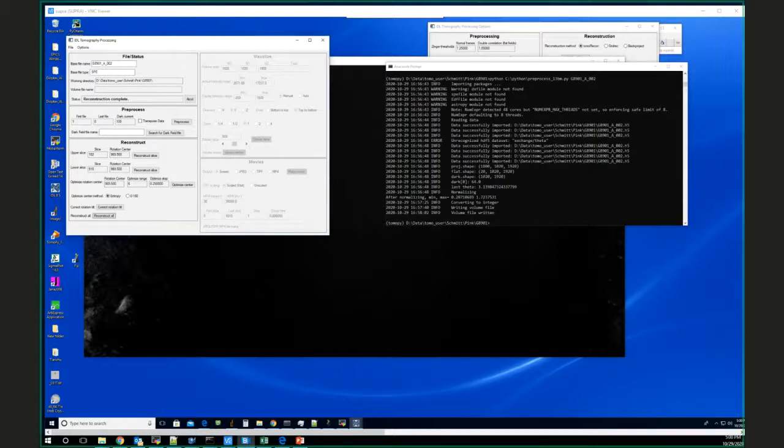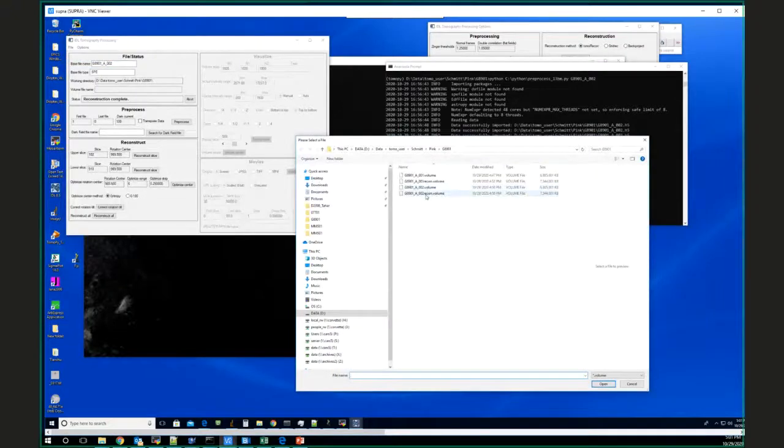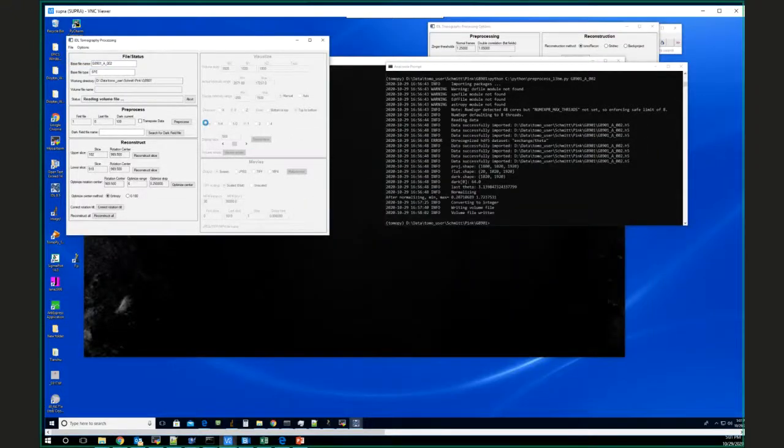Mark. Yeah. This is Yue. Hi, Yue. I have a question. I think you talked about it, I probably missed it. For the beam, your sample is several millimeters, right? Like 11 millimeters or something? These are pretty big samples. In fact, I had to choose from Doug's samples, ones that would fit in the field of view. I can make like a 16 millimeter field of view, but then the pixels get pretty big, and you lose aspect ratio in the vertical. But go ahead. Yeah, it's 11 millimeters. So the beam size has to be bigger than that, right?